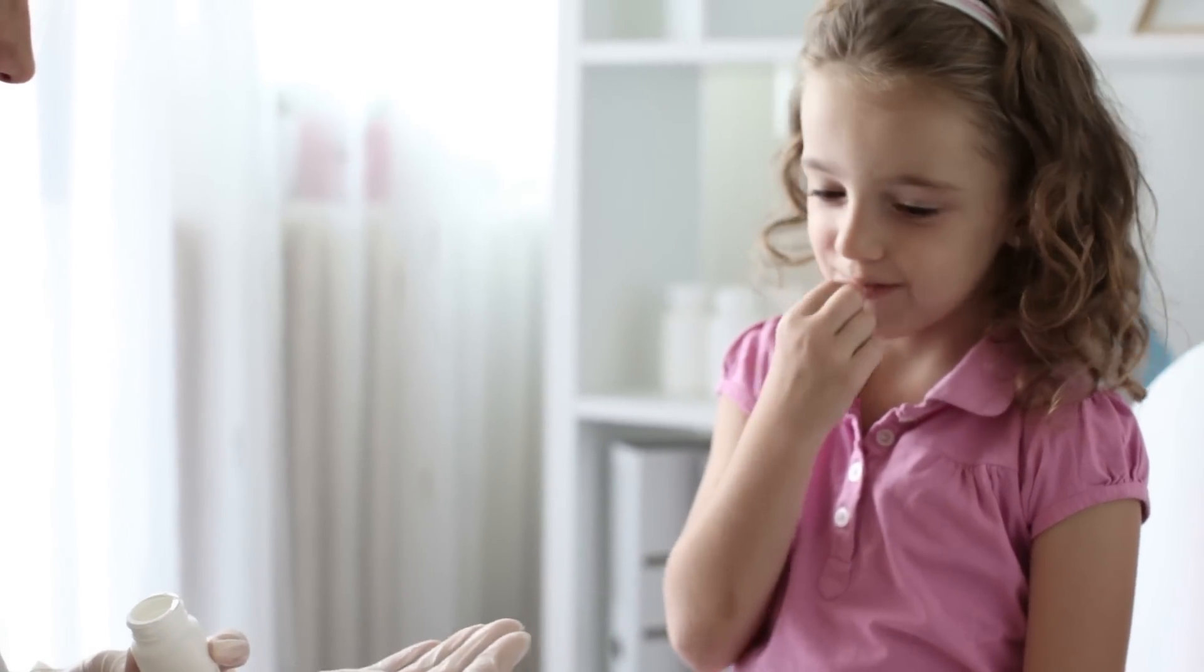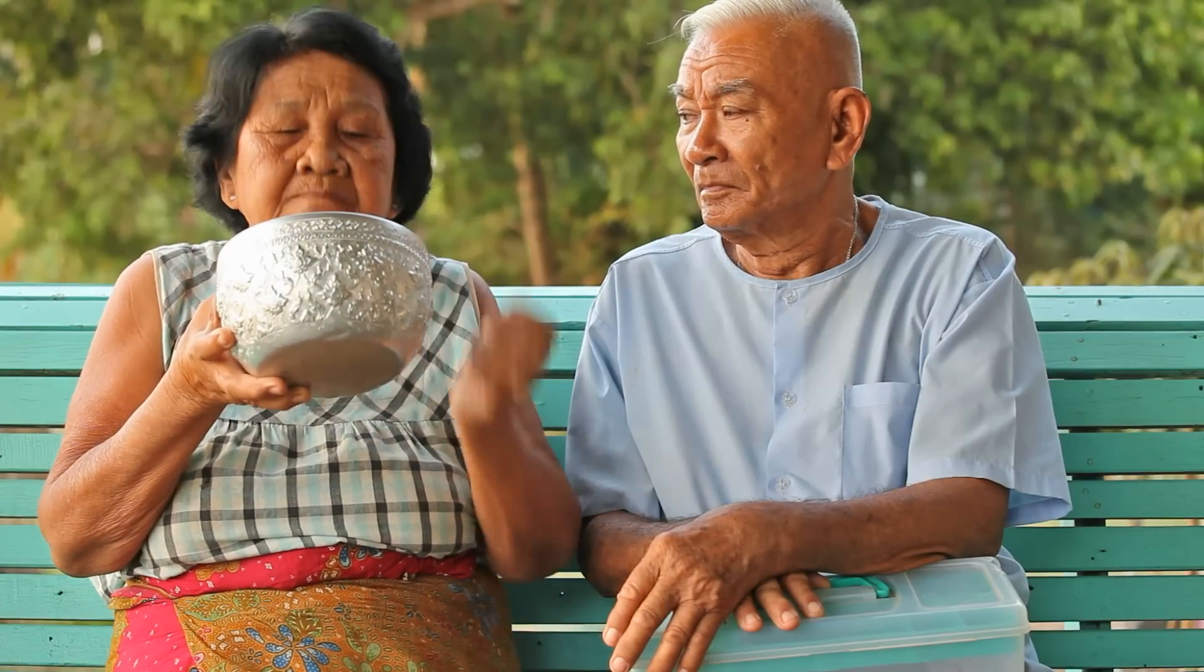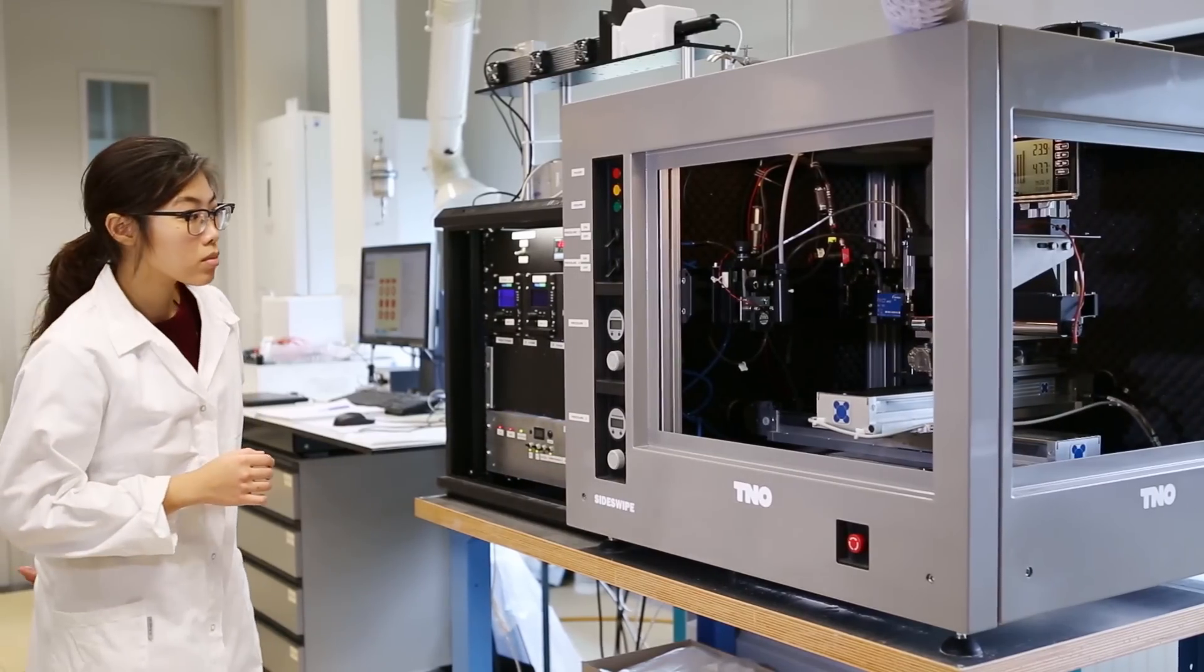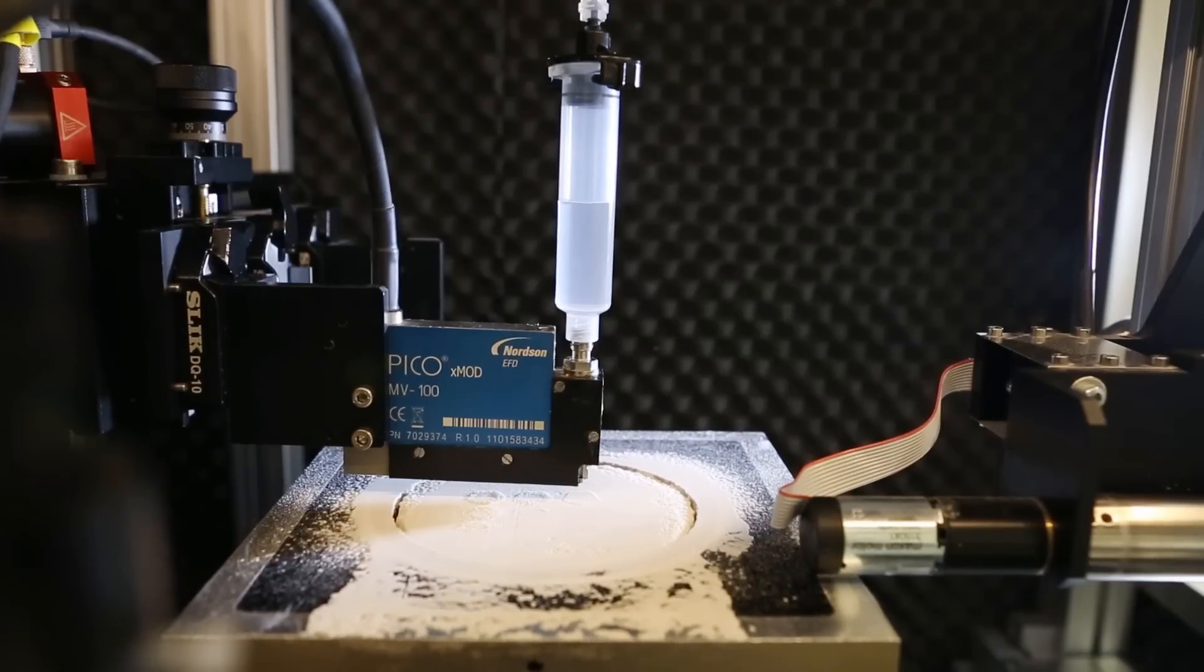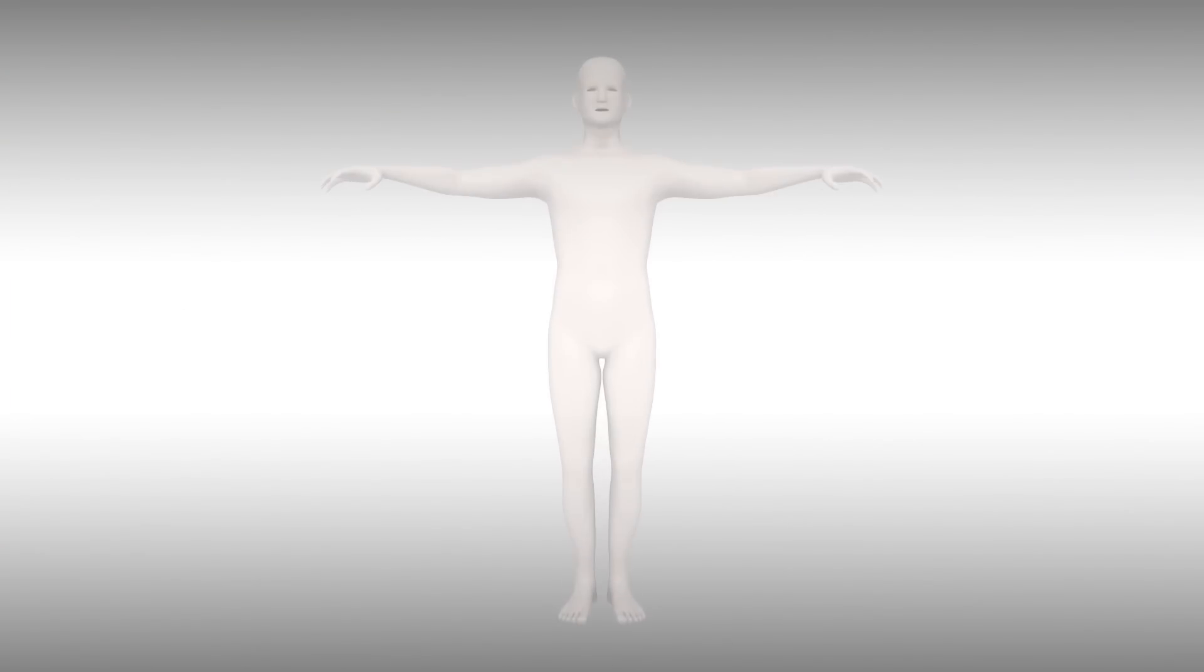TNO is working to address specific formulation challenges in oral dosing. We primarily use two types of 3D printing: powder bed printing and fused deposition modeling. These techniques offer new possibilities.